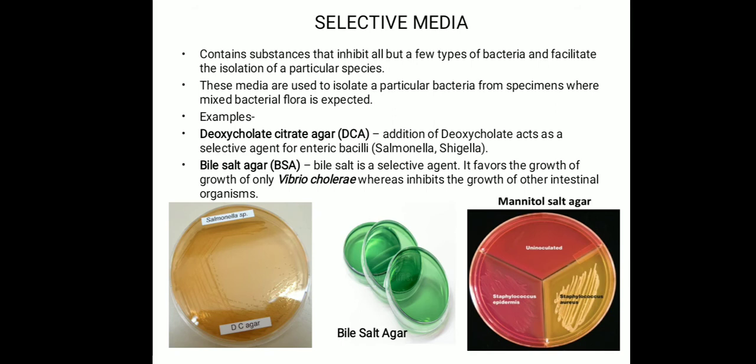Then the last picture is the MSA, mannitol salt agar. This is a selective media for Staphylococcus aureus. To differentiate it from other species, we will use mannitol salt agar. So mostly it is for Staphylococcus aureus.